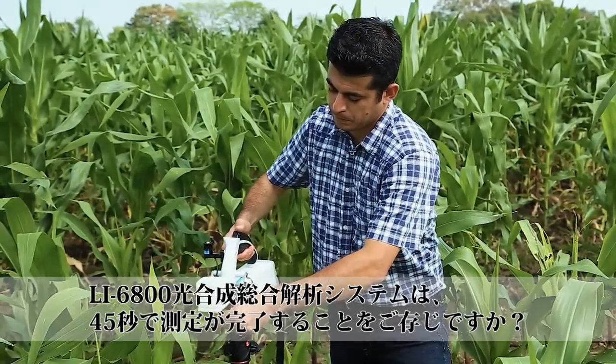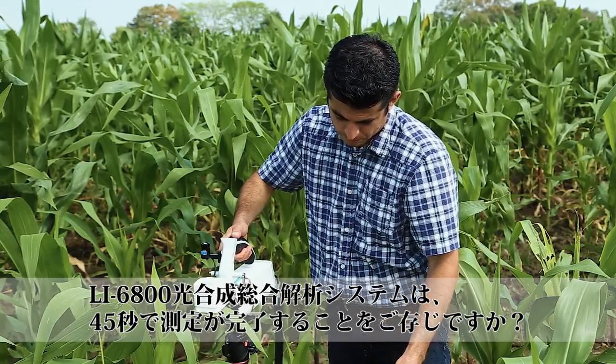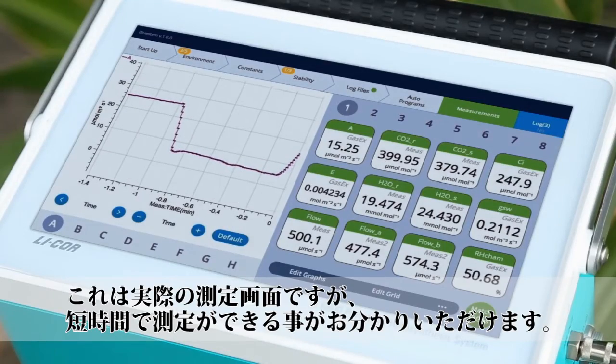Did you know that the LI6800 can complete a measurement in as little as 45 seconds? Let me show you an actual measurement.